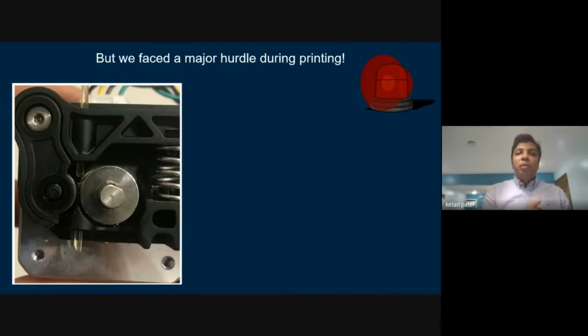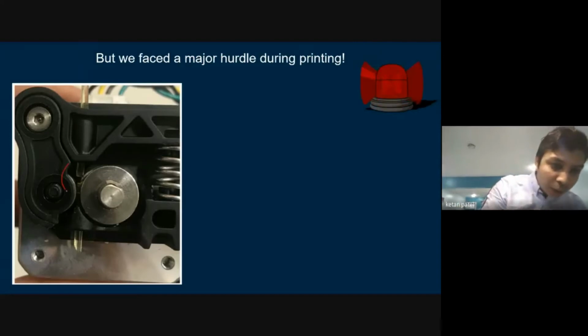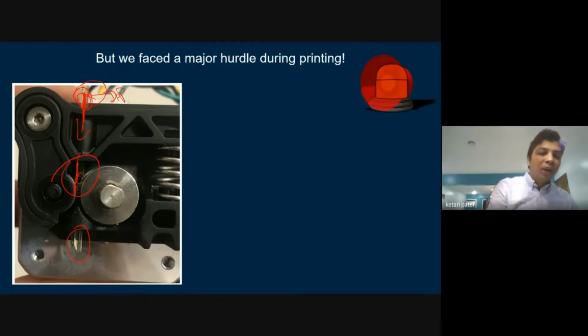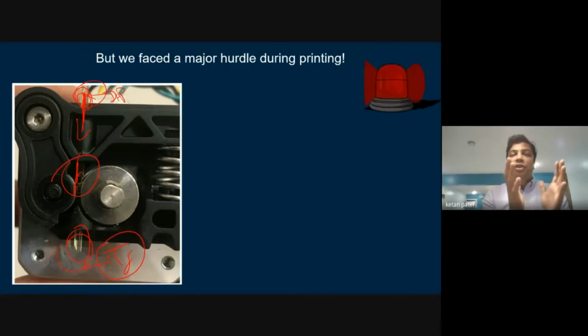The second problem, I think I mentioned in my abstract, is that the filament has to be of a certain tensile strength. If it is above or below a certain strength, then it's really not good. And it might break here if it is very brittle. So this is the gear that pushes the filament. This is the printer. So this is how you push. This is your feed material, the drug and polymer here. You get it from hot melt extrusion. You pass it through the gear, and this is where you have a heating nozzle that is above the glass transition temperature of the polymer, and it turns into a molten mass, and that's how it prints on the base plate.